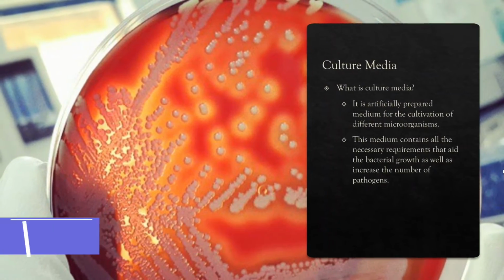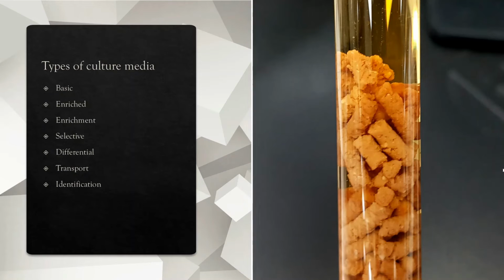There are several ways of categorizing culture media, but right now I'm going to discuss those culture media that are routinely used in a microbiology laboratory. Before going ahead, I would like to talk about the picture on the right side. This picture shows cooked meat media, which is an example of enriched media. I will explain enriched media later.